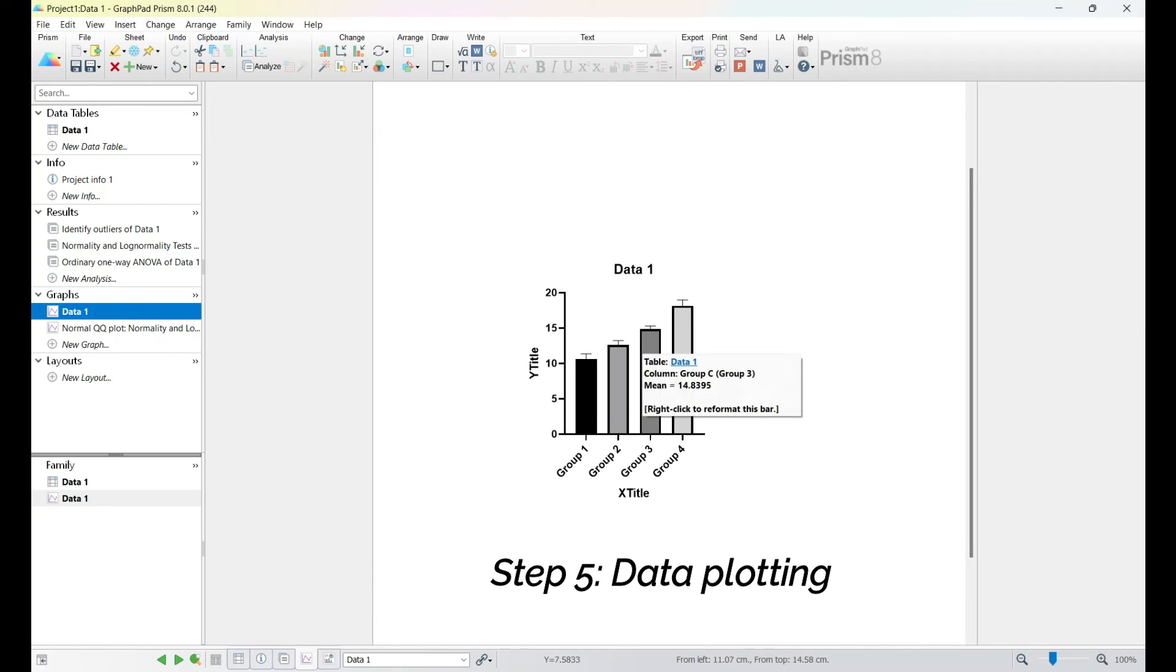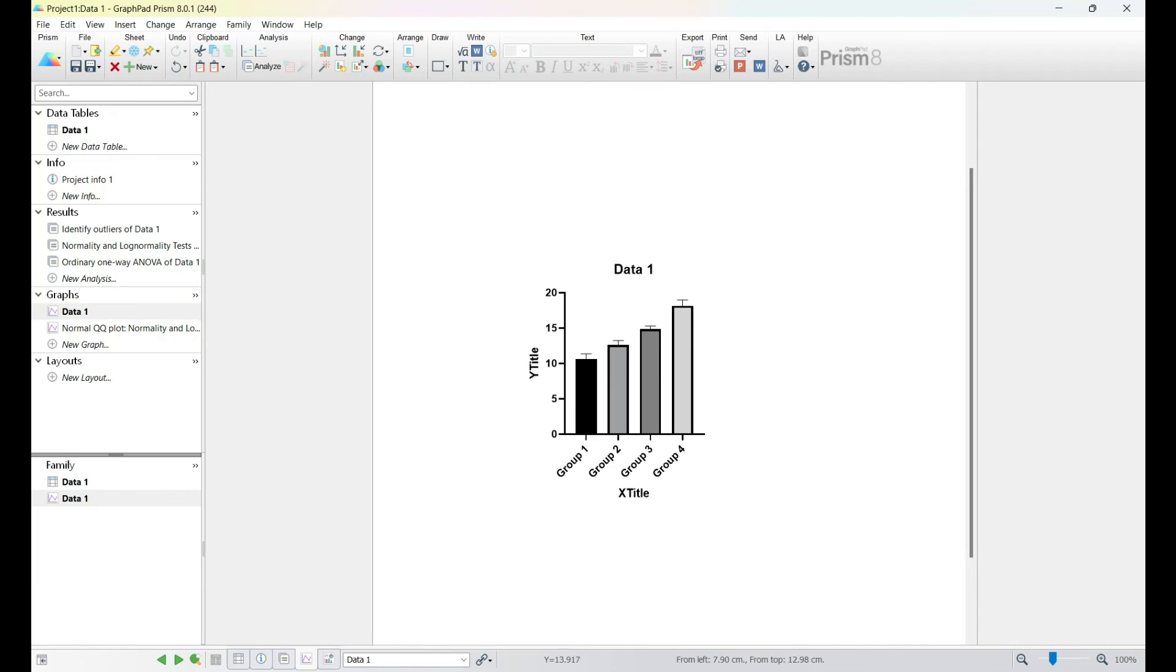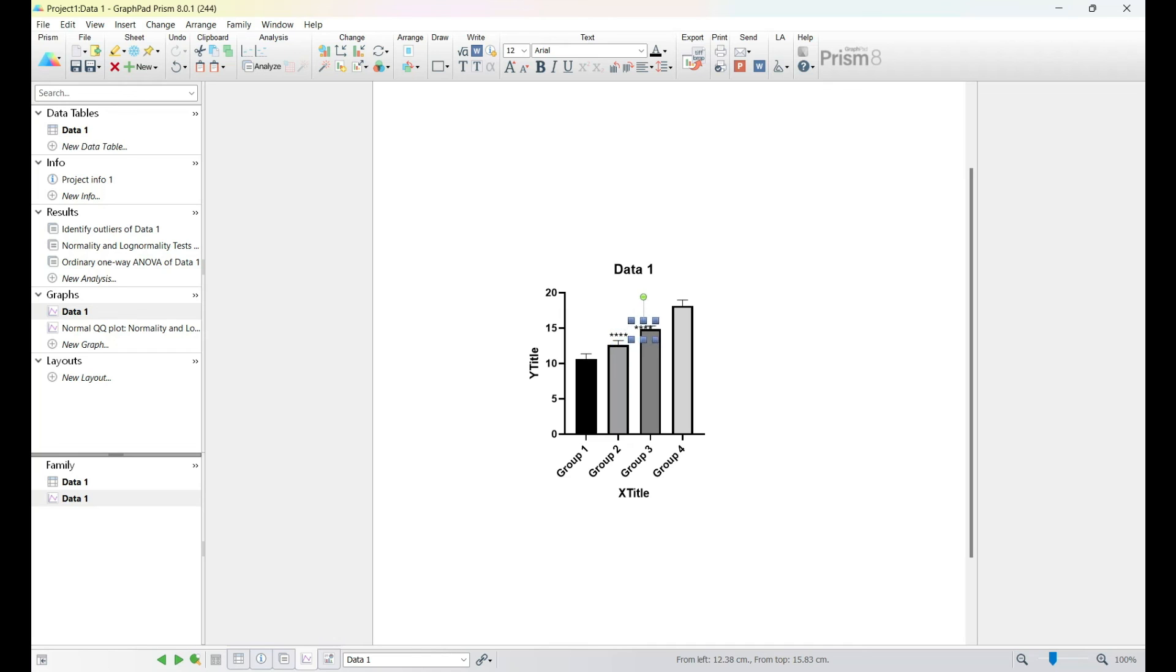Now we just need to plot our data and denote the statistical significances in each column. An automatic plot will show up once you introduce your data. Choose the one that plots the standard deviation and denote each statistical significance accordingly.